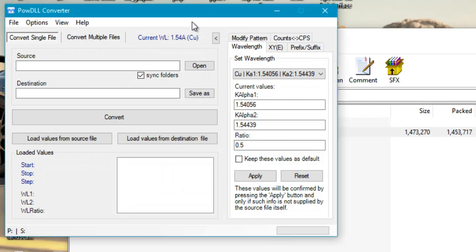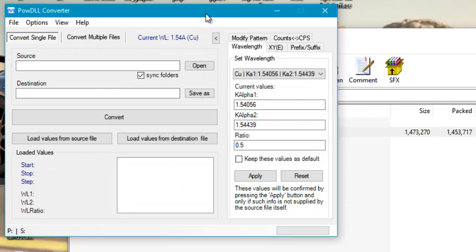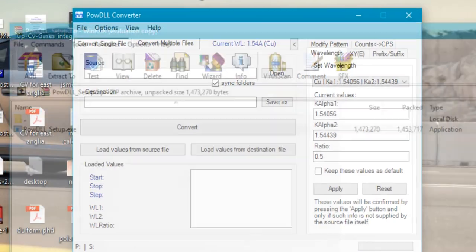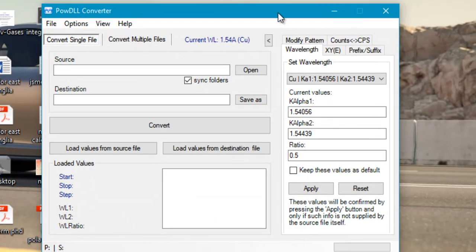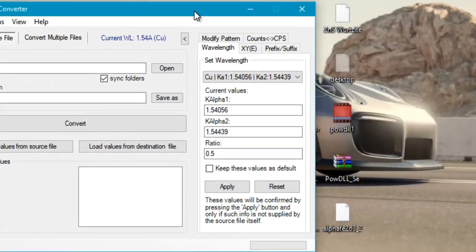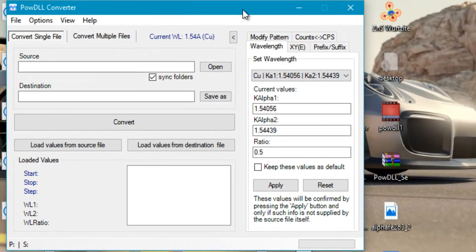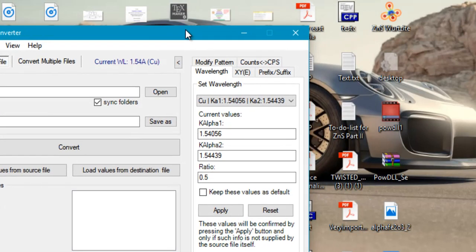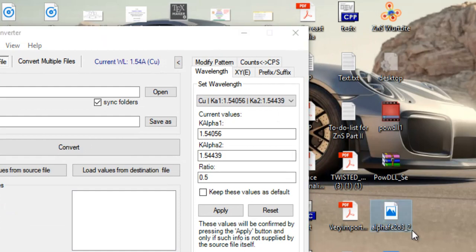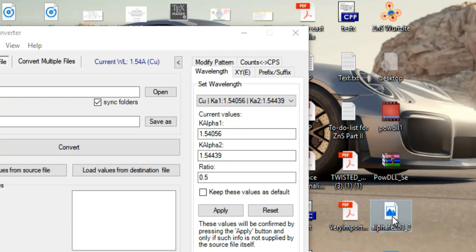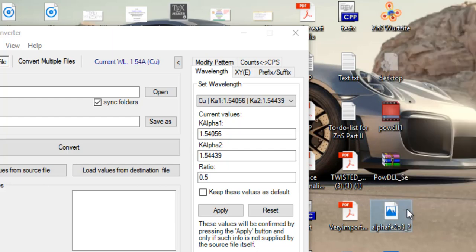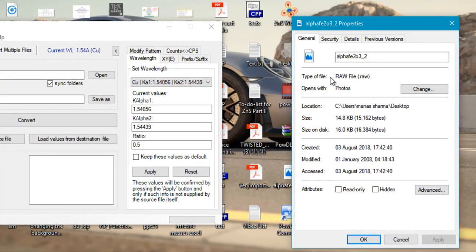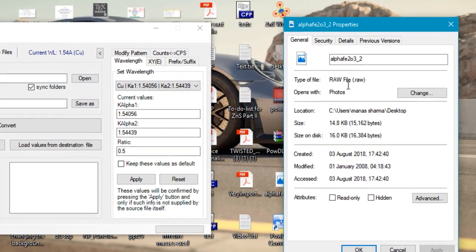Here is the window for the POWDLL converter. What we are going to do is use it to convert a raw data file generated from an XRD X-ray diffractometer into a readable format that we can use to plot it in some software such as Origin or MS Excel. Here with me I have a raw file containing the XRD pattern information of alpha Fe2O3, that is hematite.